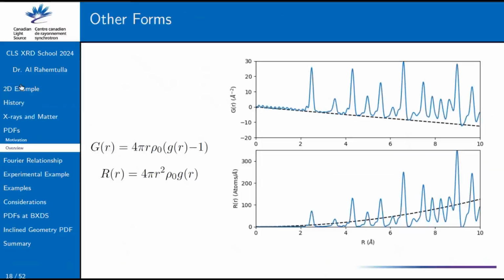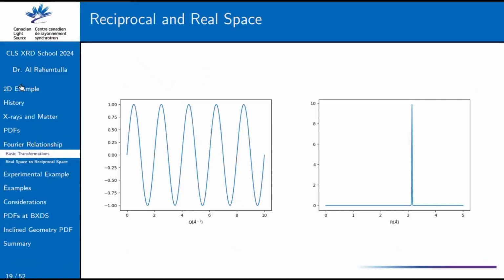And then from there, we can reformat the pair distribution function, which is what we got directly from the Fourier transform, to something maybe slightly more intuitive, like the radial distribution function. So we just have the relationships here, where we define the subfunction little g of r. And this is where we get that same increasing with r squared as we go to larger distances. And we start seeing these atomic histograms, just like we saw with that 2D example.